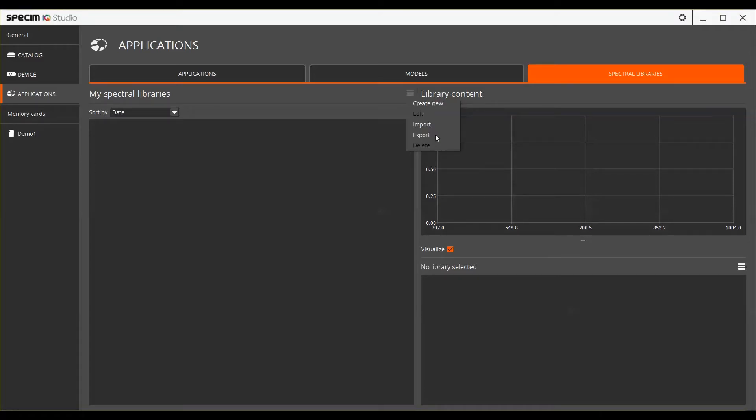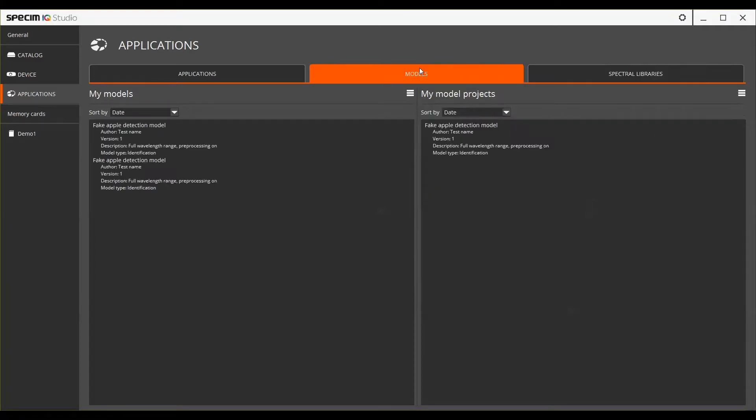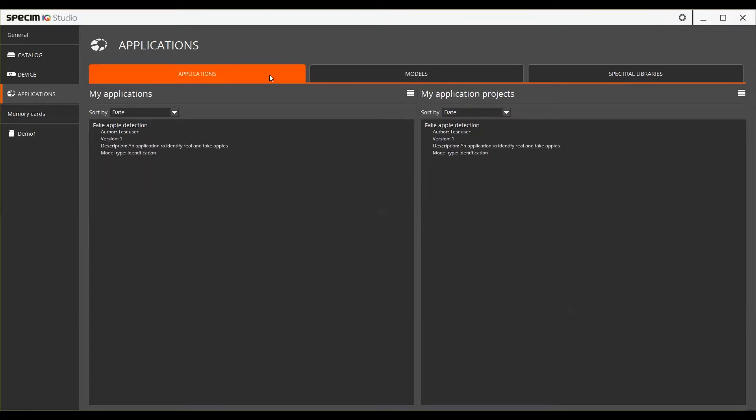On the Models tab you can manage both model projects as well as finalized models. In the Applications tab you have the control over the application projects and ready-made applications.